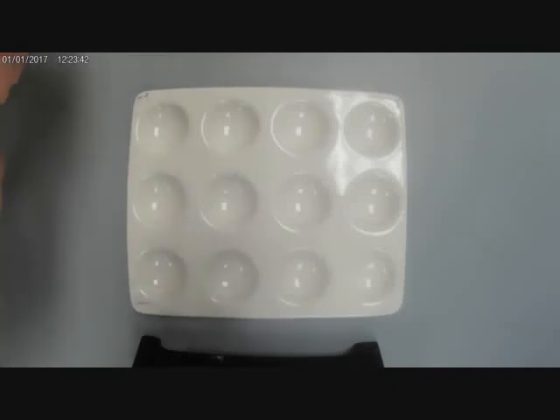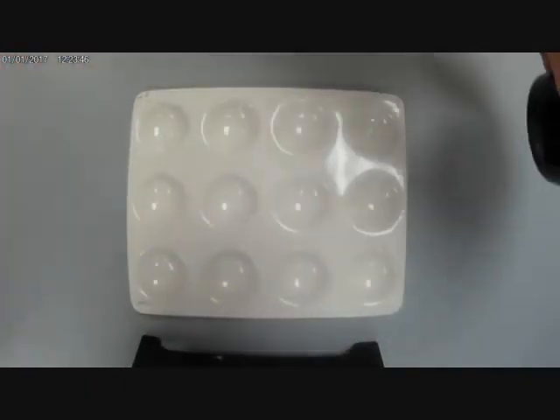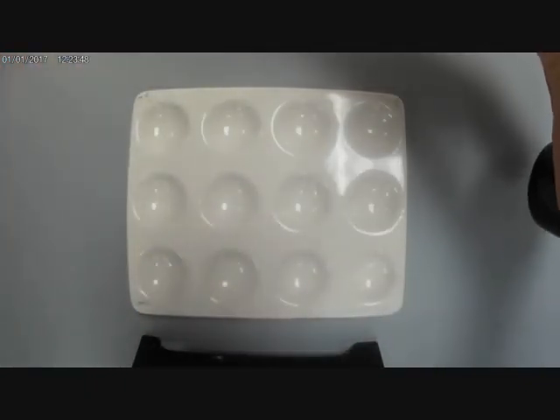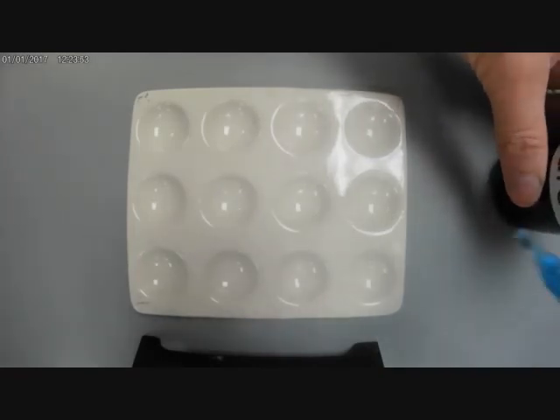Here I'm going to do a Biuret test. So here's my bottle of Biuret solution. I'm going to take the bottle and do four Biuret tests today. So I'm going to get four dimples ready for this.